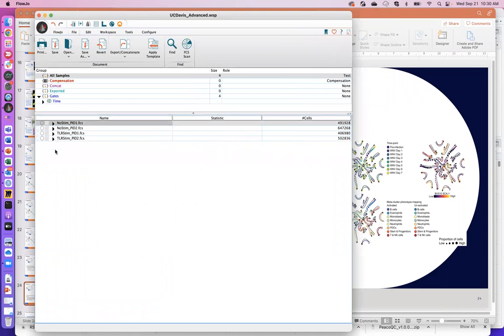Okay, so here I have 4 different files from 2 different patients, and essentially this is a fairly simple example, but it's, I don't know, a 13 color data set, and it's complex enough that we can use the dimension reduction and clustering algorithms with, and we also have a treatment associated with it, so I can show you a lot of different manipulations within the program to help you analyze the data and hopefully get you started on analyzing your own data using these tools.